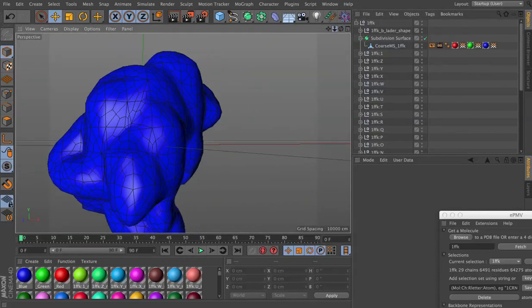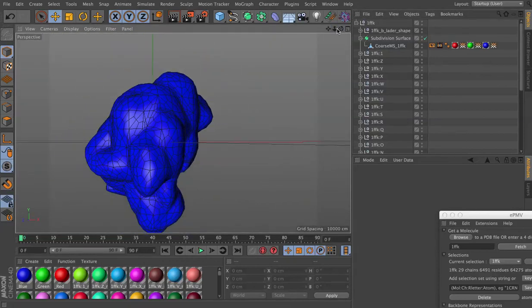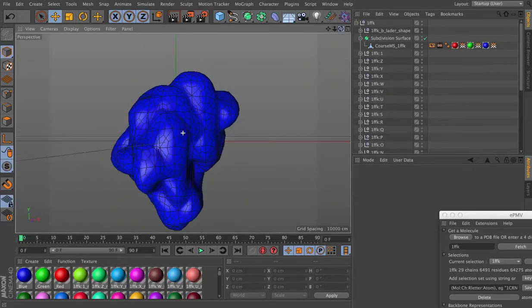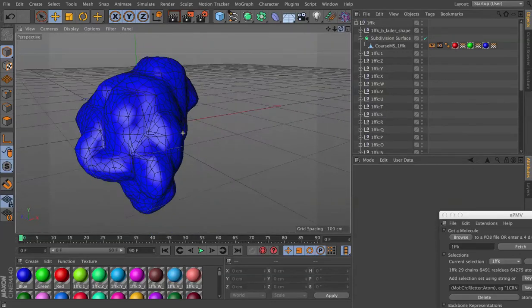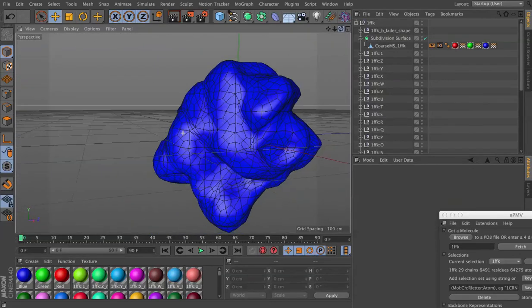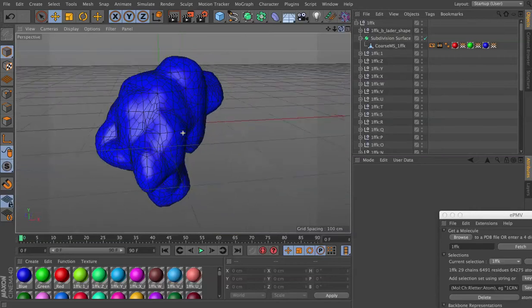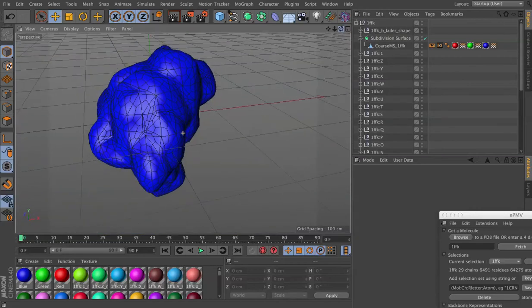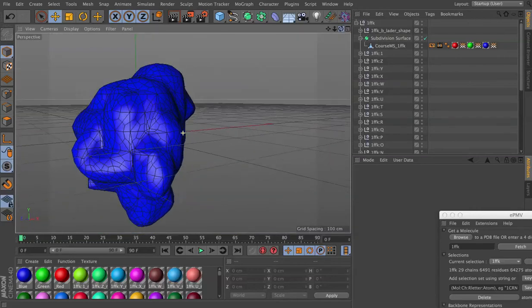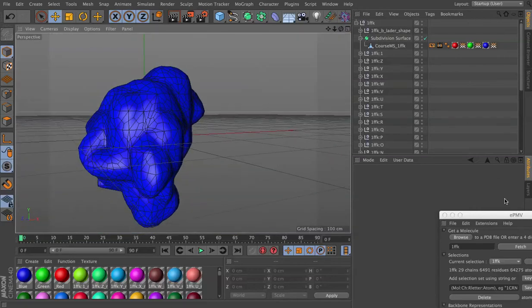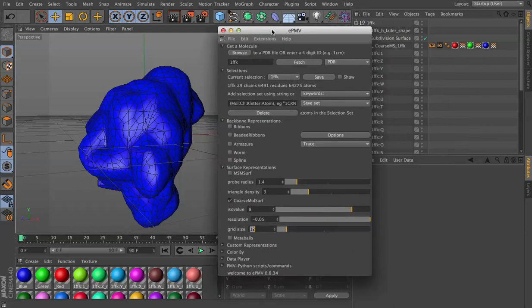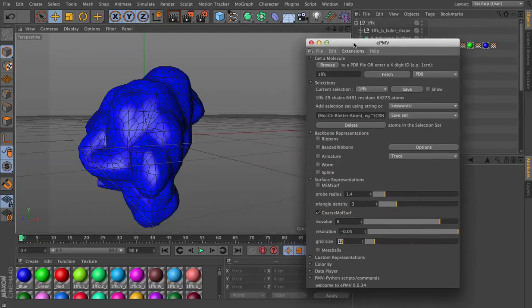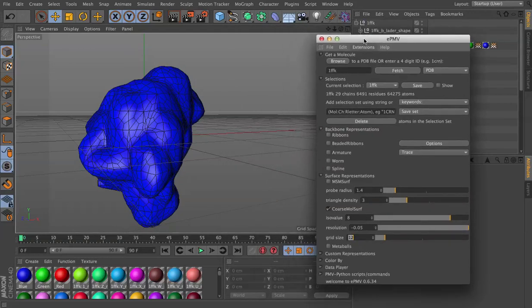So that gives us a few ways to control the representation of the structure. It follows the contour. And there are these three parameters and settings that you can play with in real time until you find something you like.